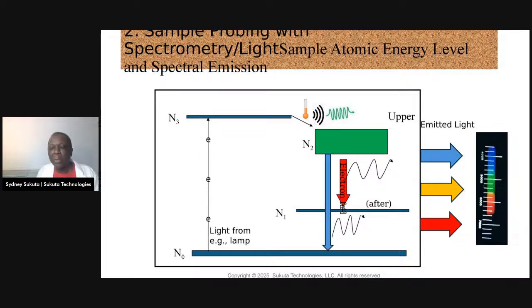Like I said earlier, we also pass light without the sample. So there's a comparison between the spectrum I just showed you and the spectrum without the sample. And then we get information about how much light was transmitted. And that's enough to come up with a lot of diagnostics. Okay.